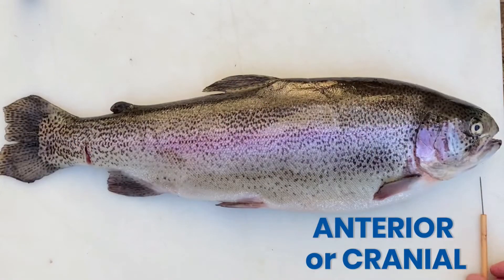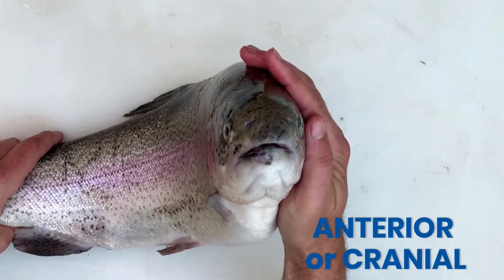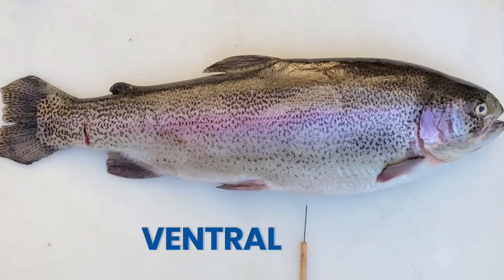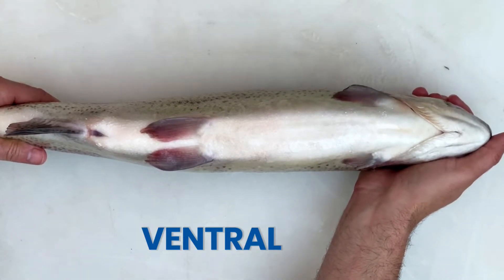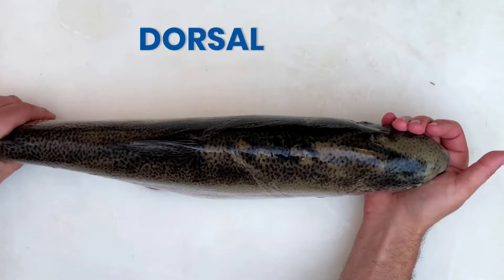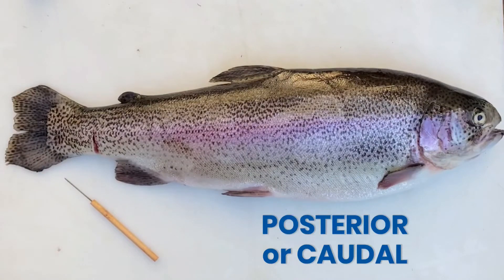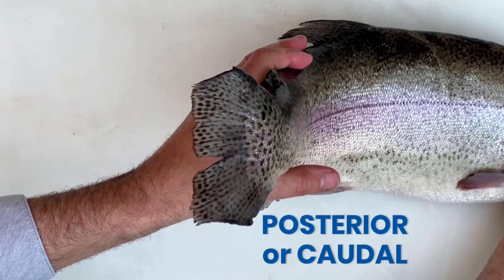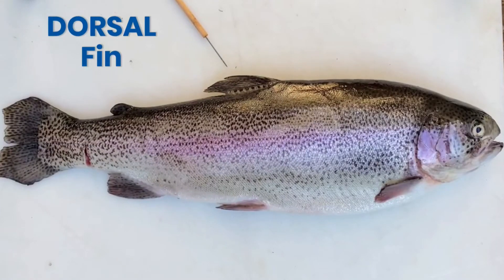Let's label our fish axes. On to our external anatomy and label the fish.